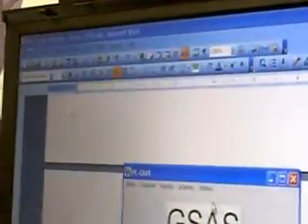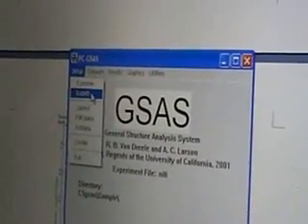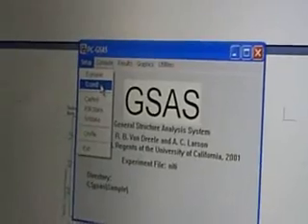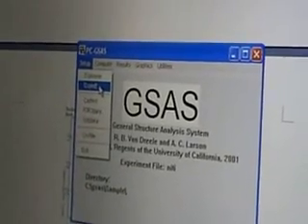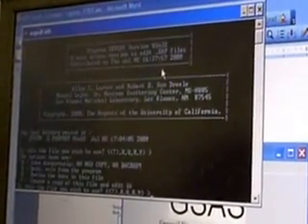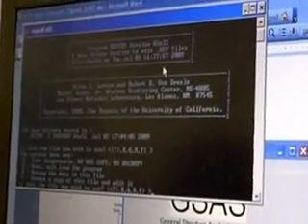PowerPref, yes. And then you need to this guy, right? Normally we choose K, live dangerously, but no copy here. But I will tell you why we need this a little later. K? Okay. Now it's K. Right now we are coming to this menu. So we need to do L. This square refinement setup.